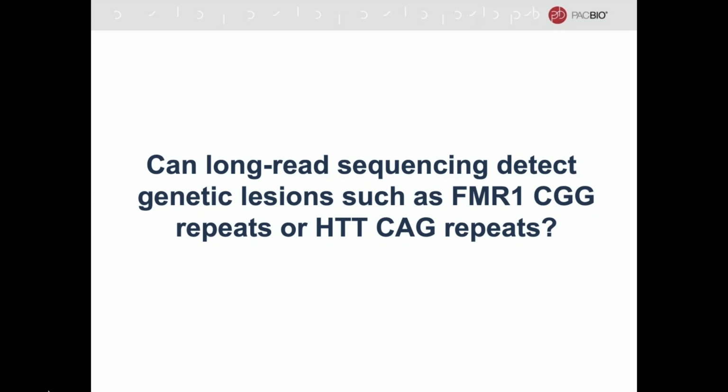You can use amplification. You can use some of these NoAmp methods that PacBio has developed. You can use oligo-based pull downs, somewhat akin to whole exome sequencing with short reads, where your oligos are complementary to your region of interest. And in this case, for almost all of those, you would use the HiFi reads, so using intramolecular consensus to resolve the complexity of those regions, to reduce the error profile, which works quite well.